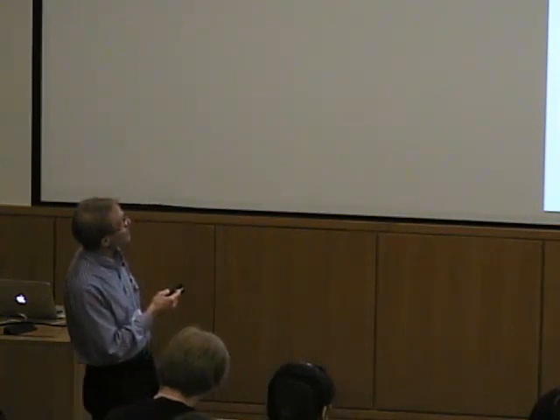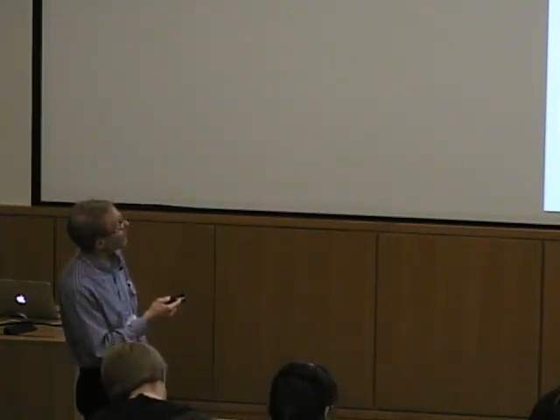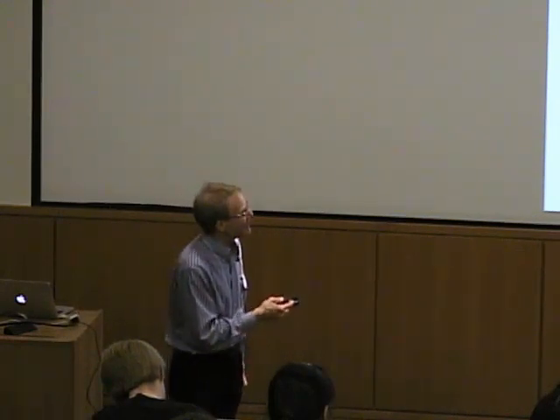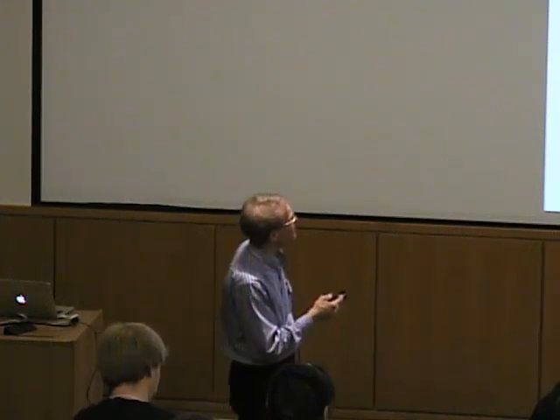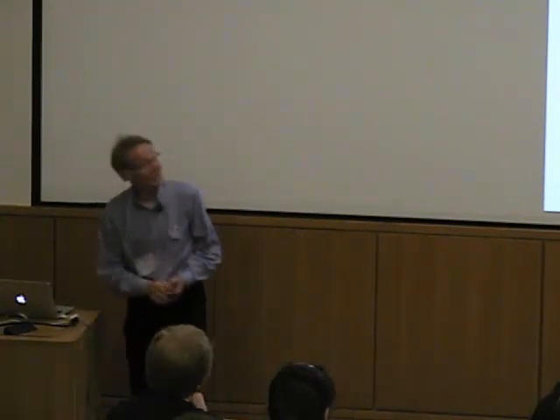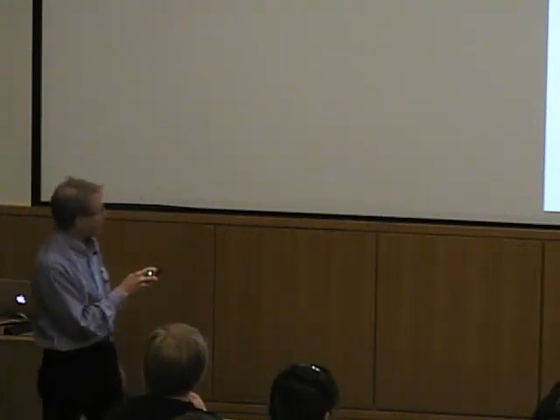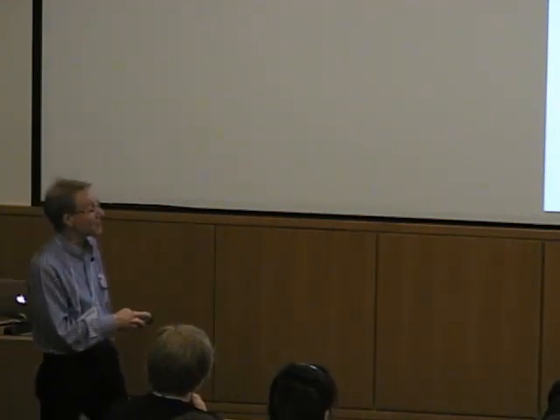Okay. Remember, it was enthalpic binding? So here's the enthalpy that they report from their data, and then here's the entropy that they get from that. Now, if my K value is suspect, and I measure my experimental enthalpy, I don't know that I put much faith in the entropy associated with that. So the lesson here, which I'll summarize in my very last slide, is that for this particular case, the correlation between ITC data and molecular processes can be challenging when it's a complex system. So don't try to overinterpret the data.